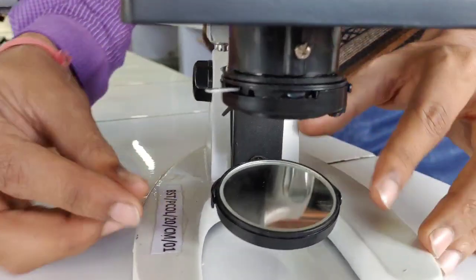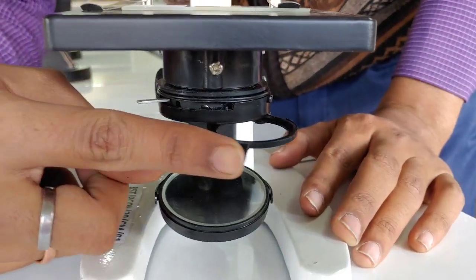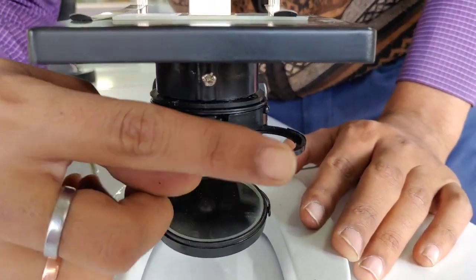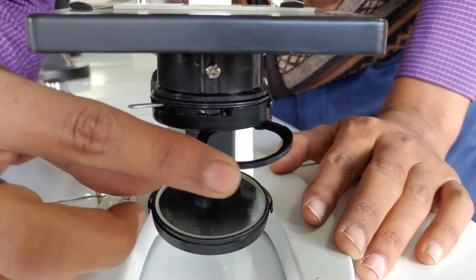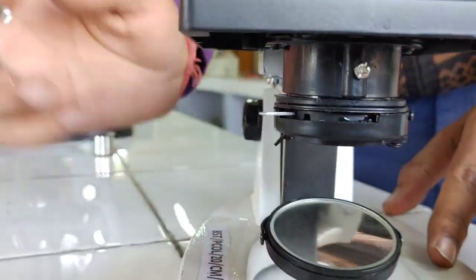Last is the iris or diaphragm. You can see in the video that there is an iris which is a thin opaque membranous structure fitted with the condenser.